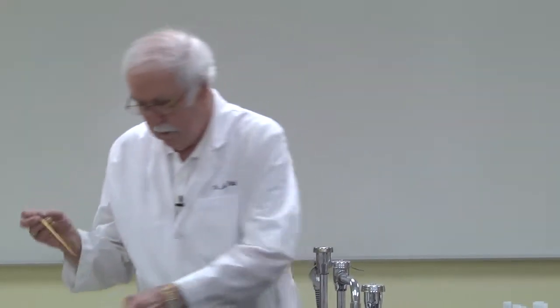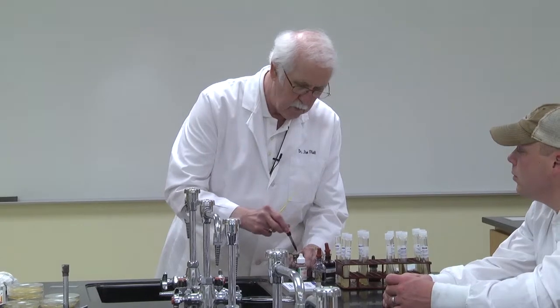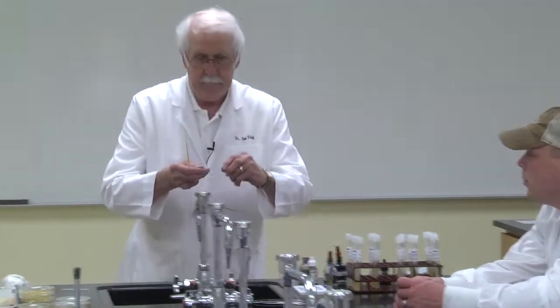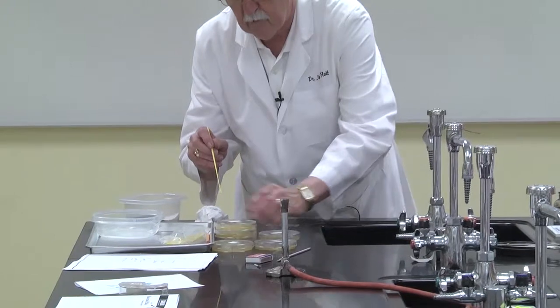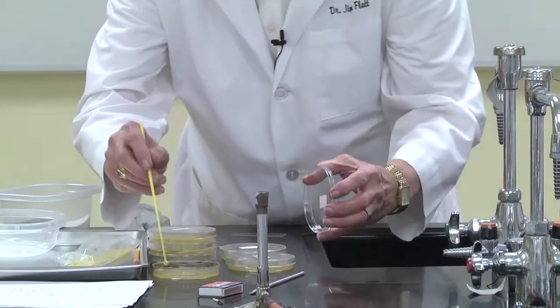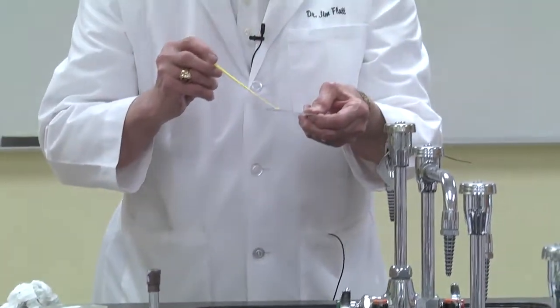The first thing we do now is put a single drop of nigrosin again at the end of the slide. This is the only staining procedure in which we will do that, by putting it at the end of the slide, like this right here. Okay? Then we lift up the edge of the plate, treat everything as if it's potentially pathogenic. We lift this up, and then we put that right back down. Let me choose this one right here. Others are kind of closed up a little bit. And then spread this out in this drop of nigrosin like that.